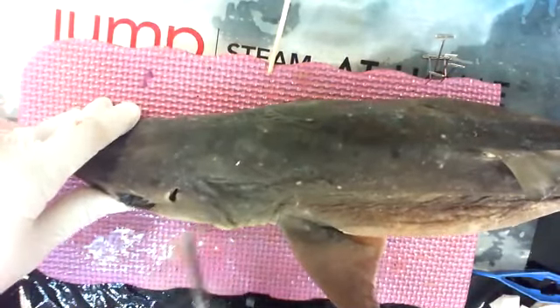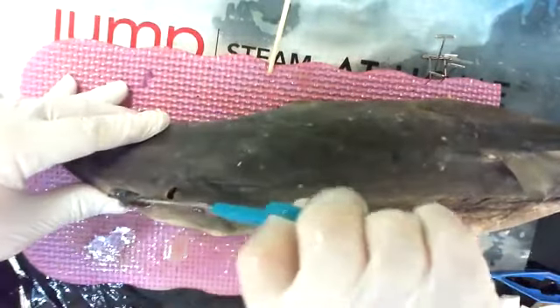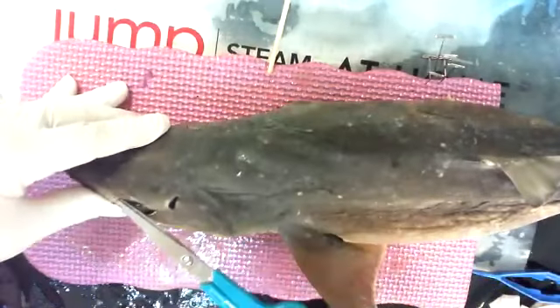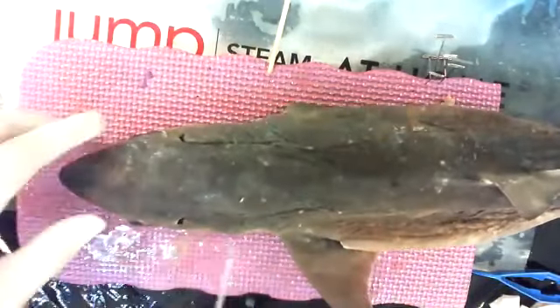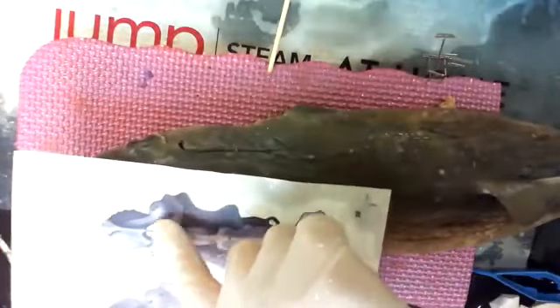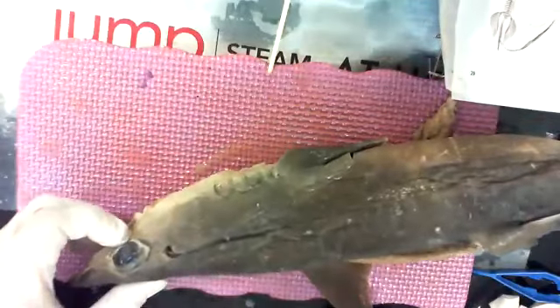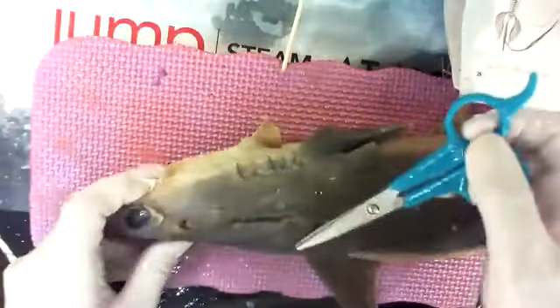So the easiest way to get to the eyeball, you can see down here, there's the eyelid. I'm going to go up to the top. The skull is all cartilage. So if I'm cutting like this. Right, here's the eye socket. That's where the eyeball's at. It's really thin through here, so I can actually aim to go up and cut the sides of the eye socket to remove it. That's what I'm going to do. I'll take this one's not bad, so I'll do this one.